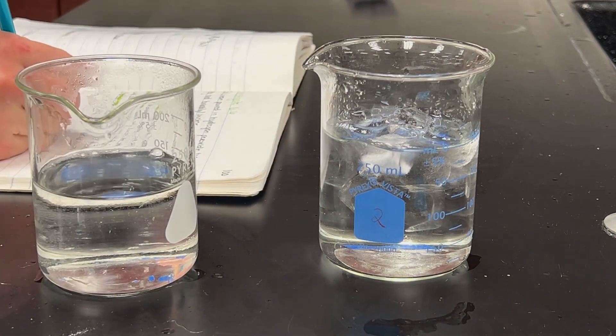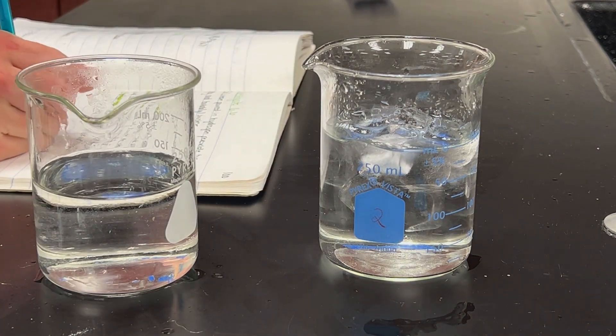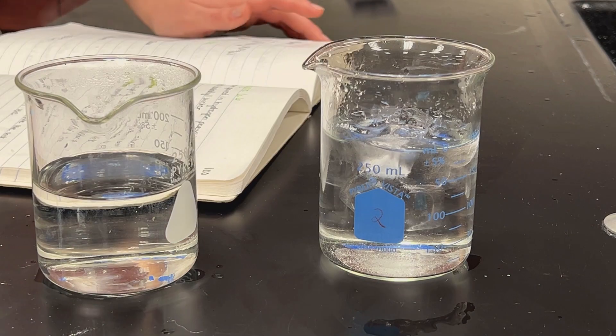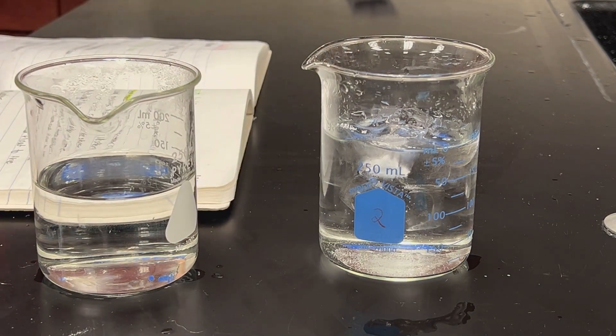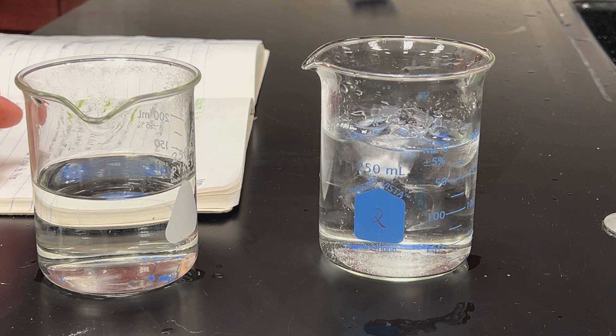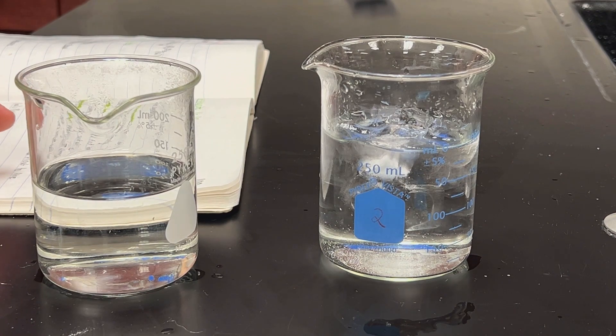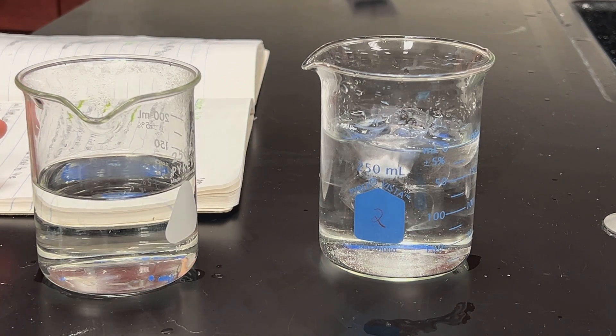You guys ready? Watch it. So prepare two beakers each containing equal amounts of 200 milliliters of room temperature water. So we're going to dump these out and fill them up with just room temperature water.